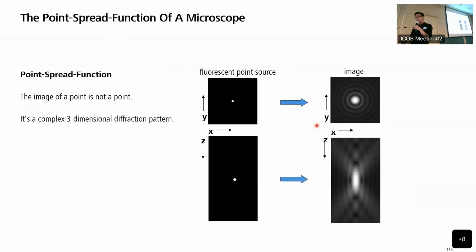Let's go check the XZ plane. Let's consider the Z-axis. The signals actually deteriorate much worse if we go through the z-stack image. So this is actually not a point anymore. It's like an ovate structure. We know based on the functions here that for the z-axis, you may experience much more diffraction when you try to focus through your samples along the z-axis.